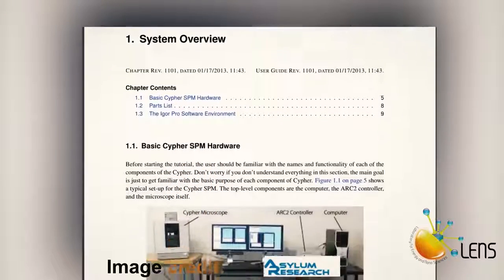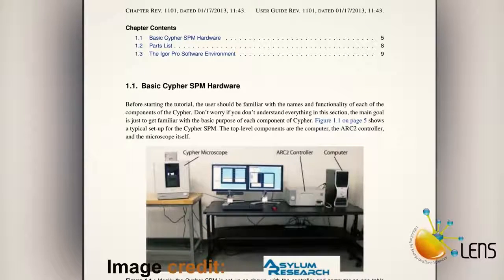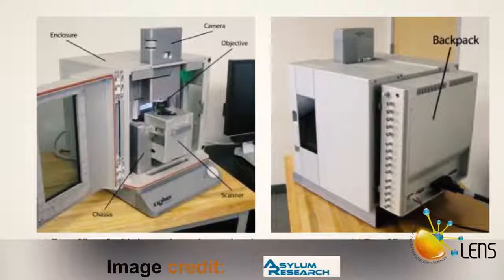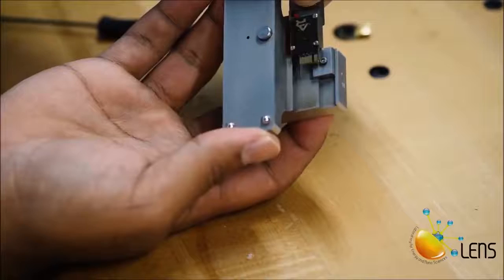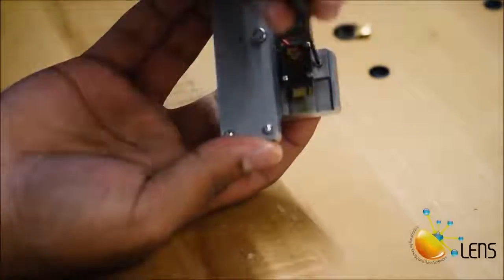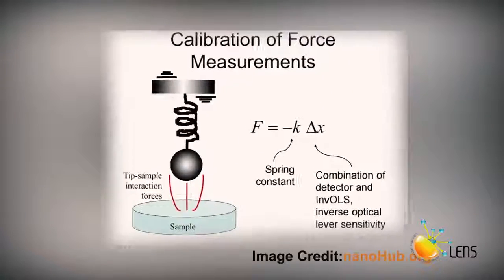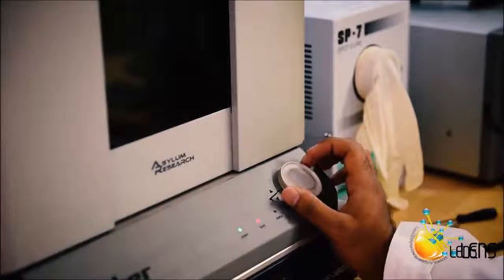In this video, I will show you how to take force data for force curves reconstruction with the Cypher machine from Asylum Research. I am assuming you are familiar with this system. Specifically, you should be able to mount a cantilever, do the first and the second calibration, as well as take the critical amplitude for the cantilever. Watch our previous videos on these topics.